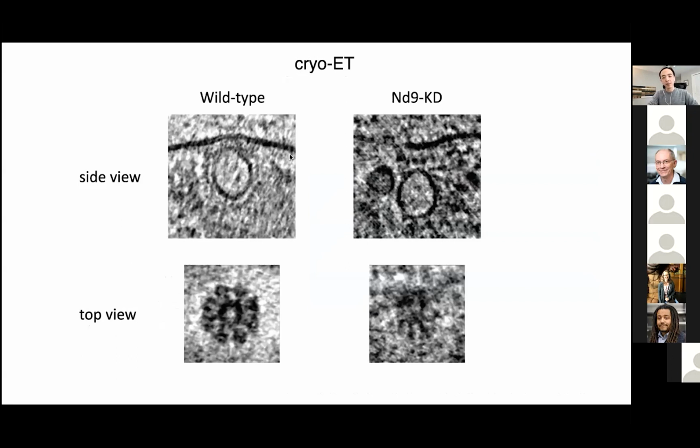The AV can be properly docked by the RSA to the membrane. The side view and the top view show the beautiful rosette-like structure. But in the mutant, the docking of the AV starts to be disrupted, becoming farther away, and the rosette structure indeed got affected. It's no longer a beautiful structure. Again, this supports that the ND protein is involved in the rhoptry secretion system.